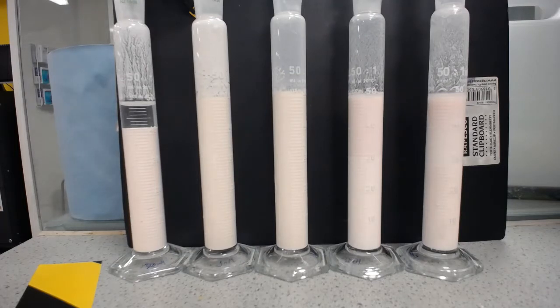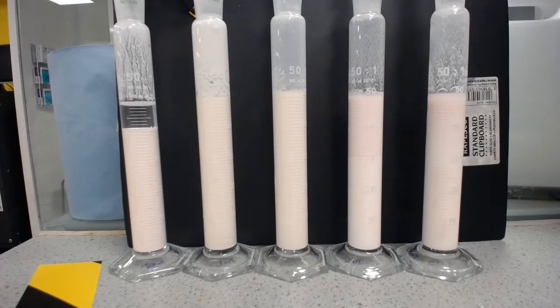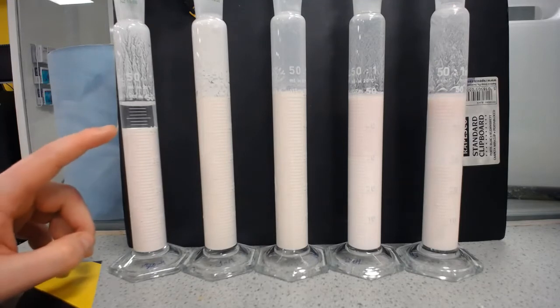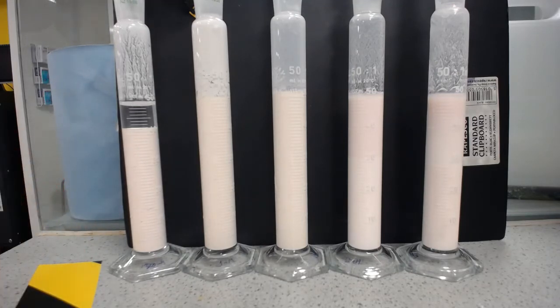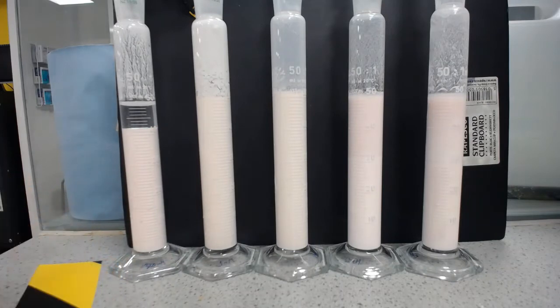So if we look at formulation A on the far left, this one was just calamine, zinc, glycerin and water, and we can see that we've got a very clear line of sedimentation there. So I would say that the volume for the sediment is 42 millilitres for that one. So we've got 42, and then you divide that by 50. Now for formulation B, I think that looks pretty homogeneous the whole way through, so I would say that that hasn't sedimented at all, 50 over 50.